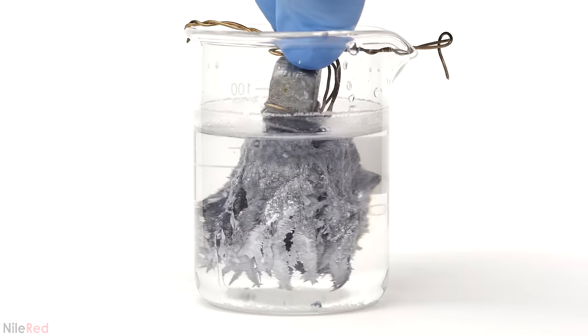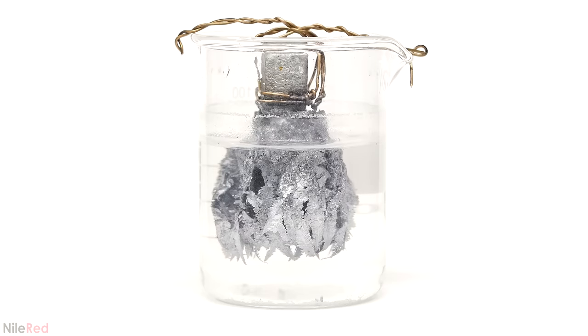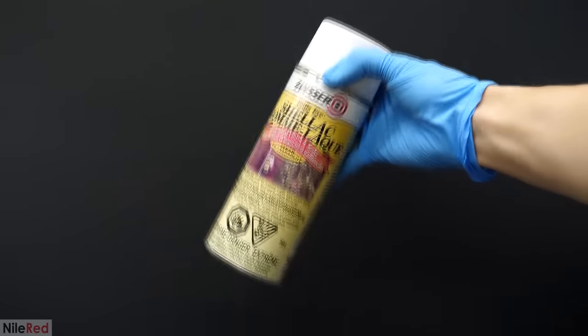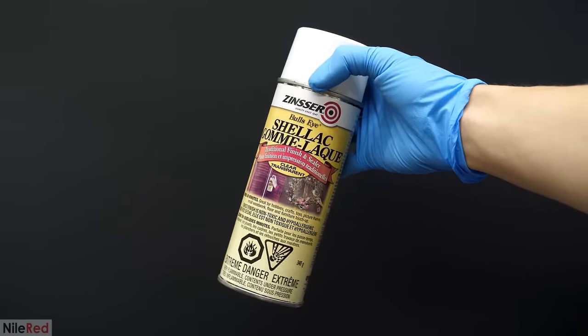To try to make it shiny again, I added it back to the lead acetate solution along with a bit of acetic acid. The acid should remove the lead carbonate, and it seemed to kind of work. At this point though, the thin and relatively delicate lead crystals were already quite damaged.